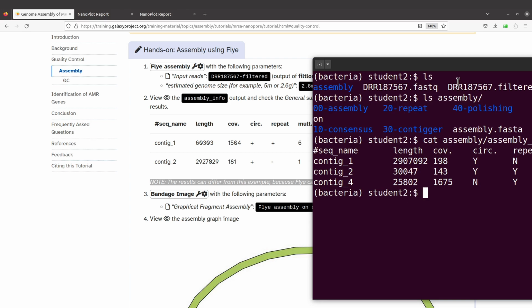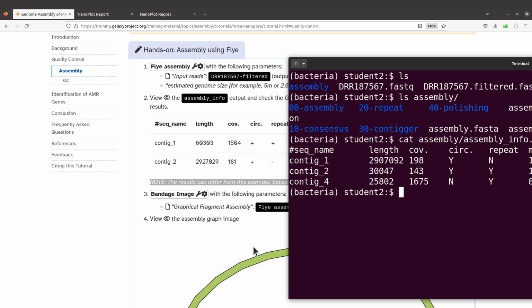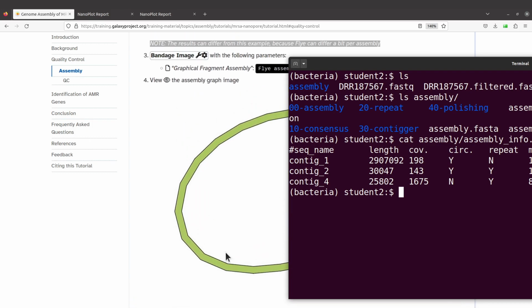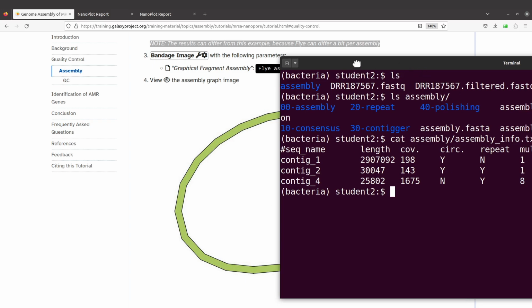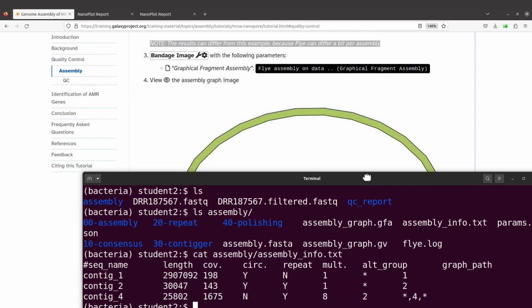All right. So these things will help you get started. It's important you always look at that. And then you also have to factor in the genome size. You even have to factor in whether the organism that you are dealing with has plasmids or not. I mean, there are certain things you also need to factor in, the biology of the organism. Once you know them, it helps you to easily understand the results you have. So we are going to proceed.